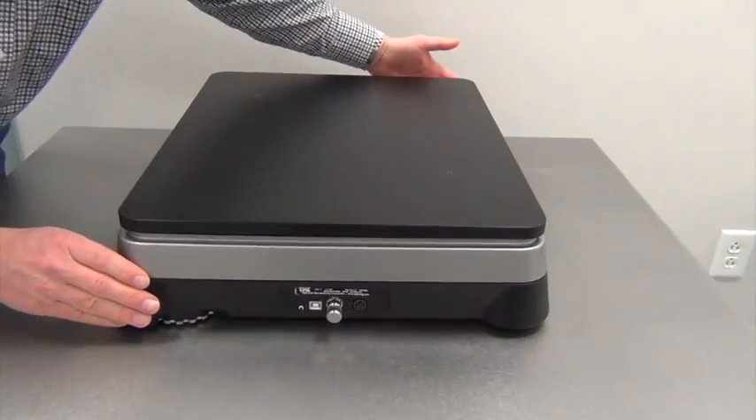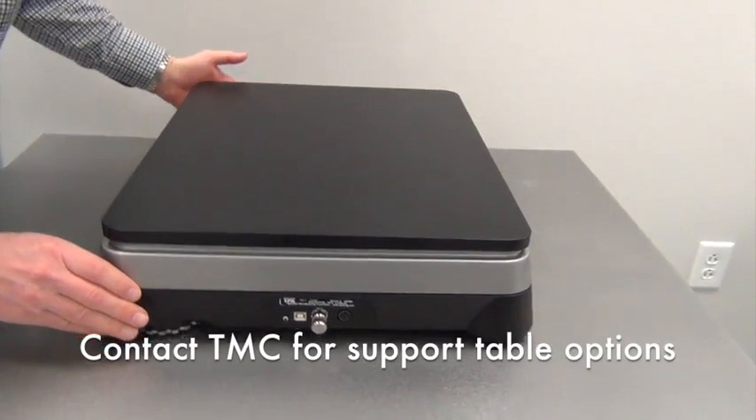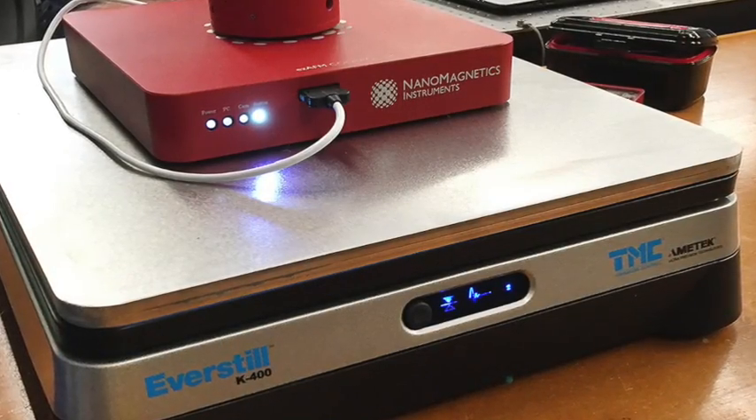Utilizing downward-looking, low-frequency inertial sensors, the K400 requires a robust and rigid support table. Contact TMC for support table options.